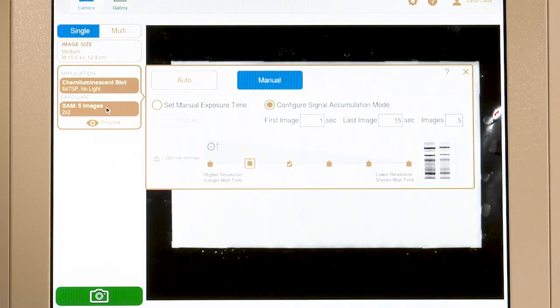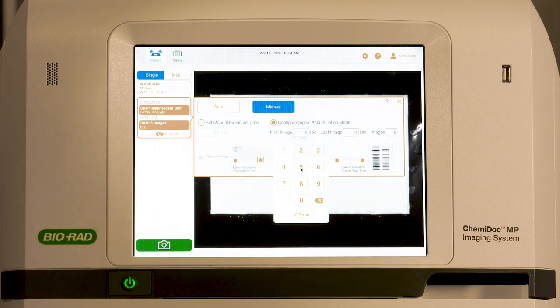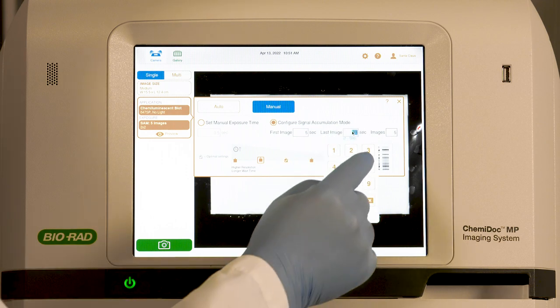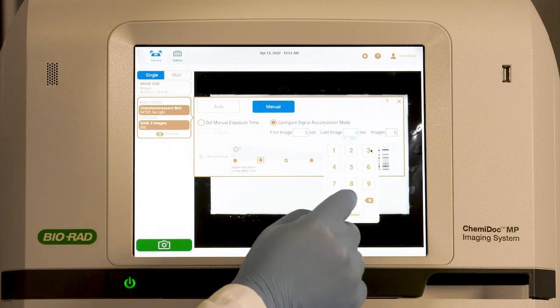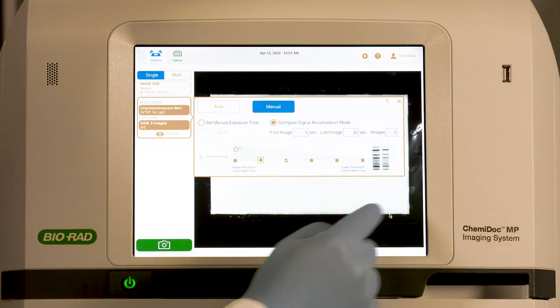To use signal accumulation mode, select the manual exposure setting. Estimate the shortest and longest exposure times that you want the system to acquire. Then enter the number of images that you want acquired during this interval.